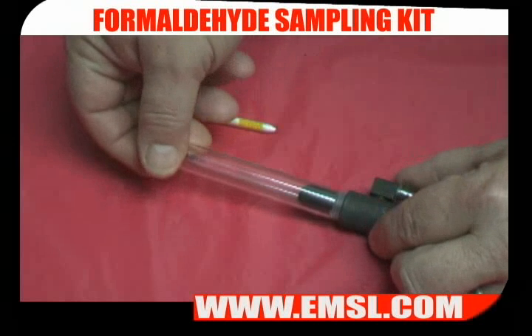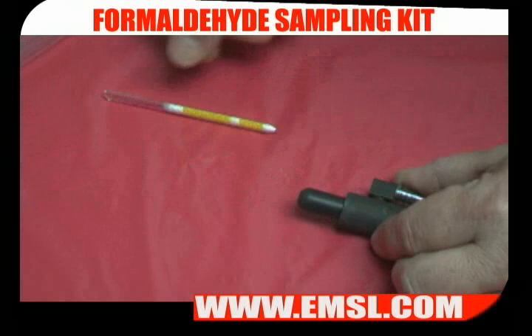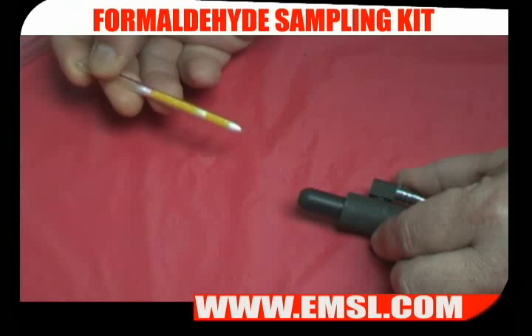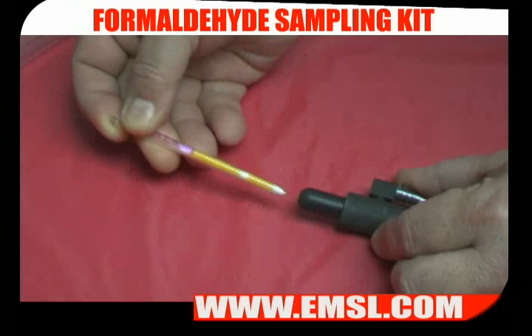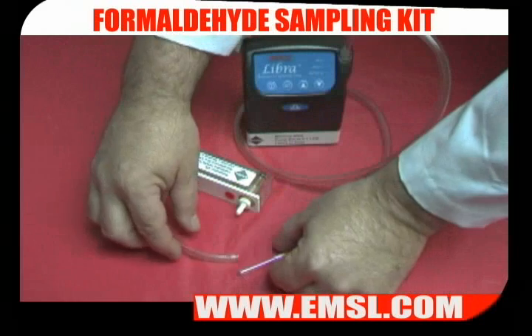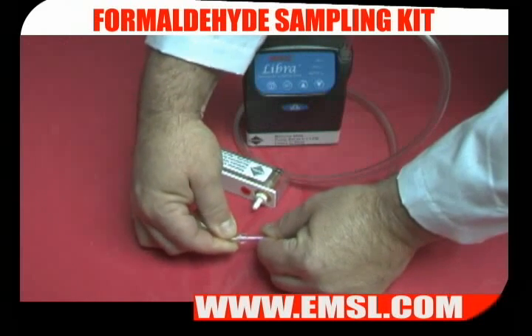First, remove the tube shield from the low flow adapter. Next, insert the sorbent tube, sorbent end first, into the low flow adapter. Attach the rotometer tubing to the inlet of the sorbent tube and turn on the pump.